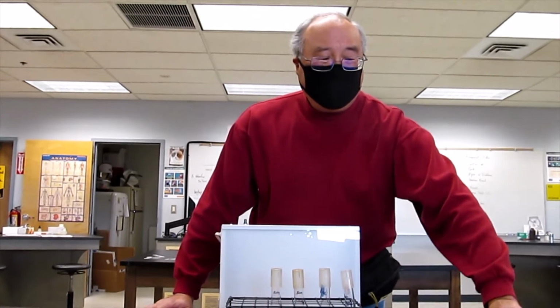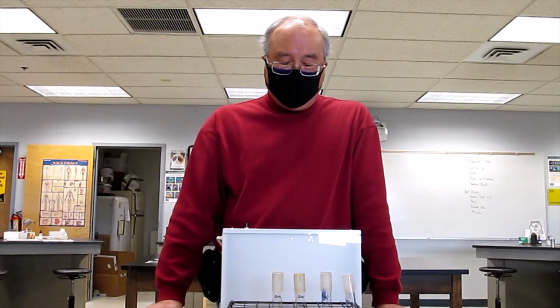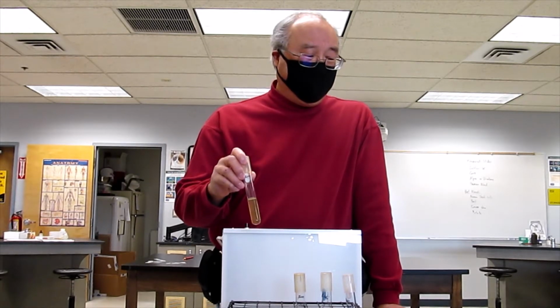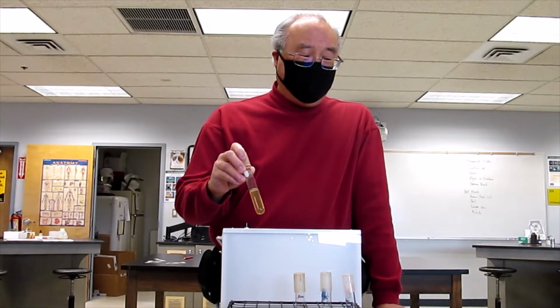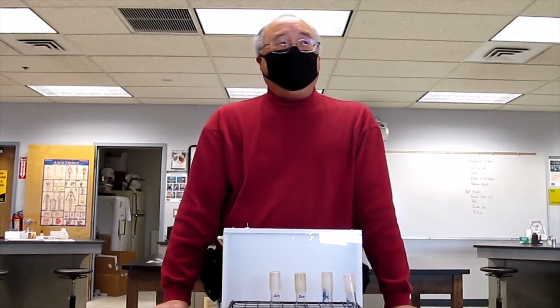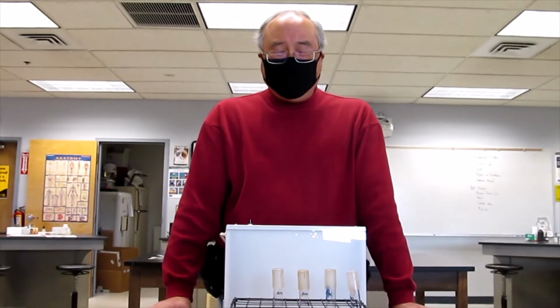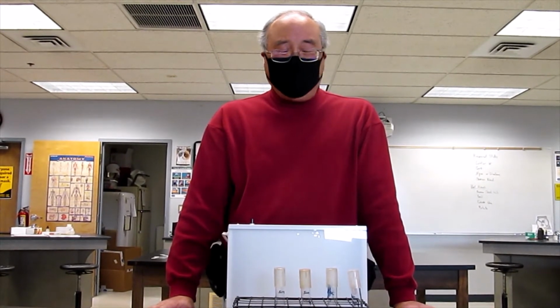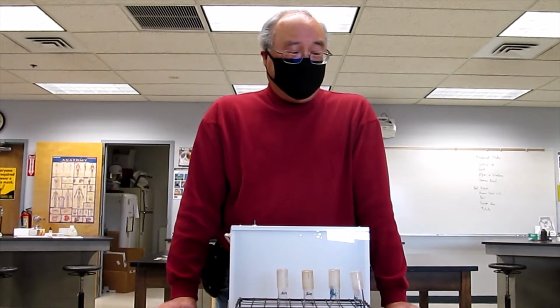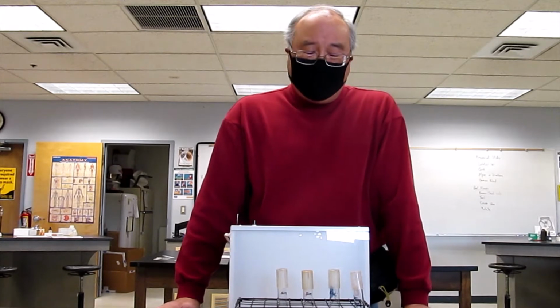Hi, this is Chris again, and today we're going to talk about the analysis of the information you can get from inoculating your bacteria in what we call a SIM tube. SIM stands for Sulfide Indole Motility, and this is what one would refer to as a multi-test media, because with one inoculation you can get results on three different properties of your bacteria: whether it can produce hydrogen sulfide, whether it can produce indole, and whether it is motile, it can swim away from your inoculation stab.